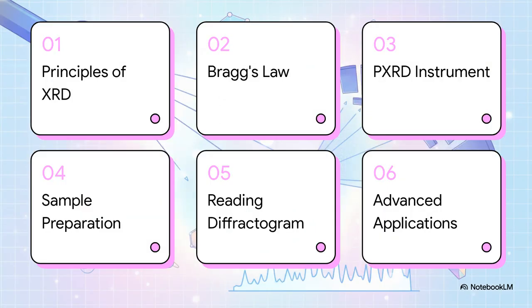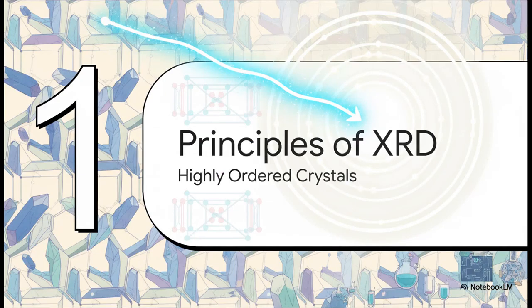So here's our roadmap for today's explainer. We'll quickly cover the principles of X-ray diffraction, break down Bragg's law, explore the PXRD instrument itself, talk about the absolutely crucial step of sample preparation, learn how to read a diffractogram, and wrap up with some advanced PXRD applications. Okay, let's dive right into Section 1, the principles of X-ray diffraction.